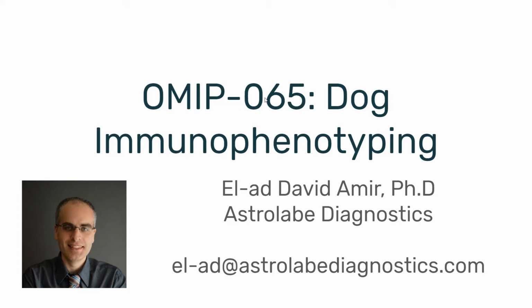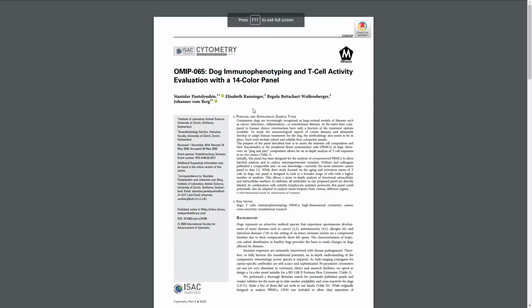Today I'd like to talk about the latest OMIP paper that came from Cytometry A. And this one deals with immunophenotyping of canines, of dog in particular. And this is a really cute paper. I really enjoyed reading it, short and sweet.